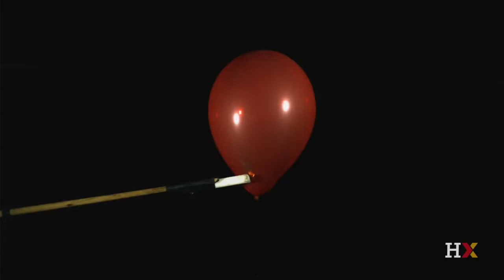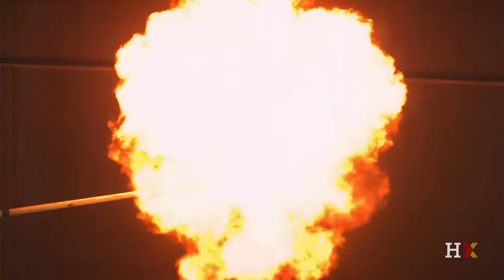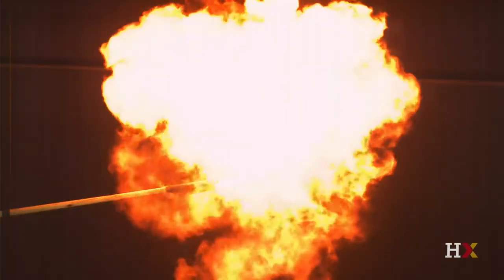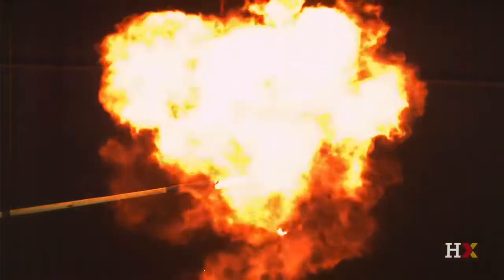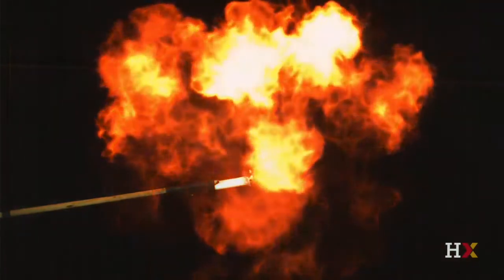As the gas rushes out of the balloon, it does blow out the candle. But because the balloon is filled with pre-mixed hydrogen and oxygen gas molecules, they immediately react and produce a bright flame as the balloon skin begins to peel back. The reaction is extremely fast and explosive, producing the intense fireball that we observed. The flame from the hydrogen and oxygen reaction reignites the candle.